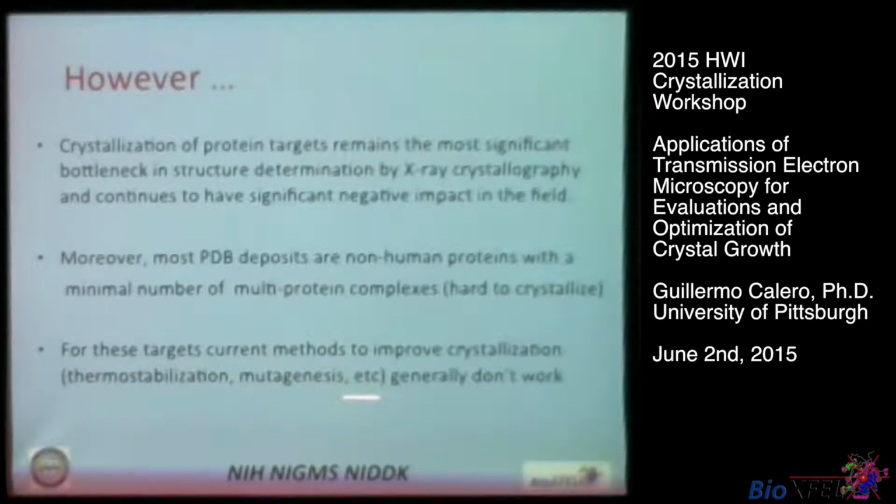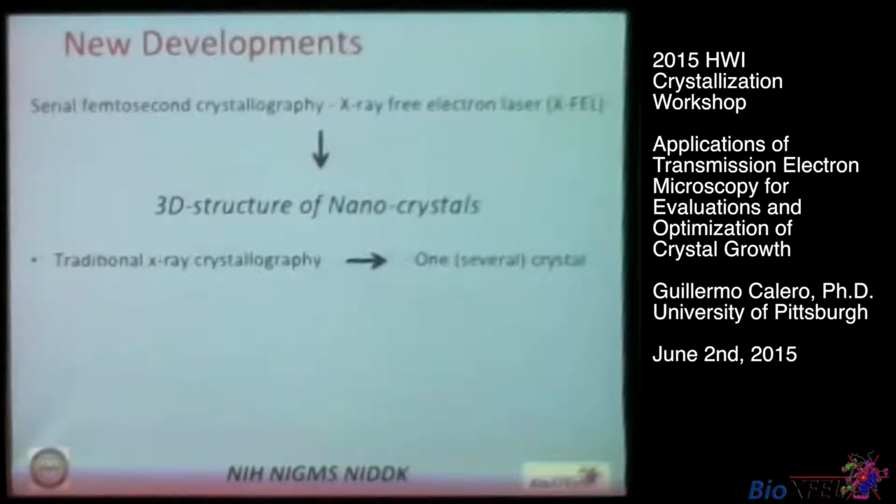However, as you know, and I'm going to barely talk about this, there's the development of serial femtosecond crystallography with the use of free electron lasers, which now allows us to solve three-dimensional structures using nanocrystals. Traditional crystallography uses one or several crystals. Of course, solving a structure using nanocrystals requires billions of crystals.